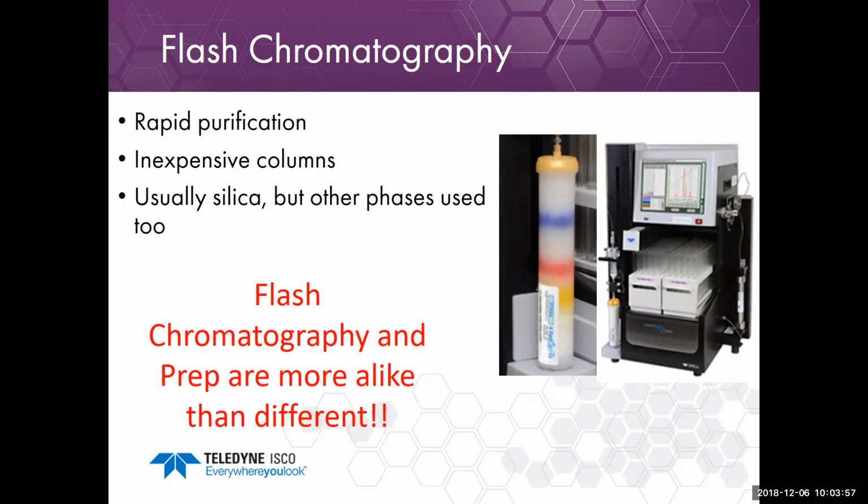Sometimes the same instrument can be used for flash and prep. The image on the right is an EasyPrep system with a preparative LC on one side on the left, and it takes a flash column over on the right.